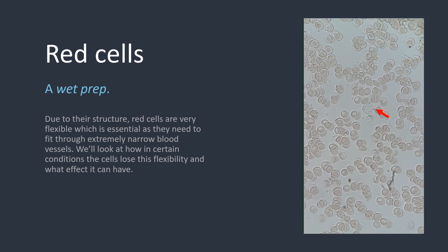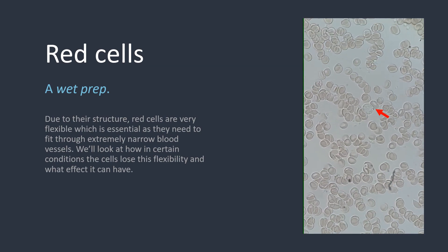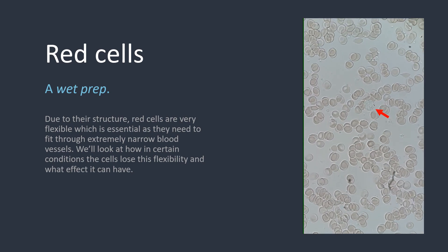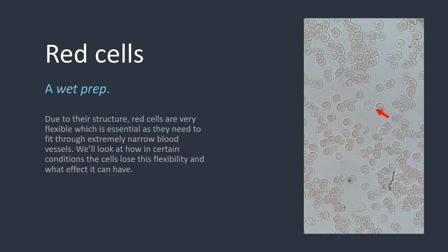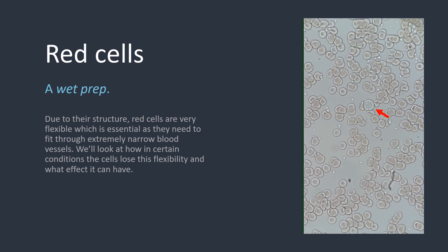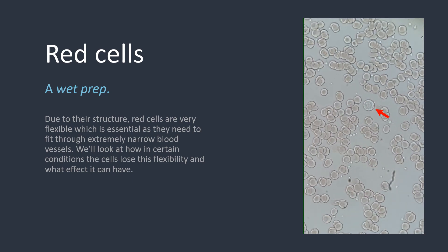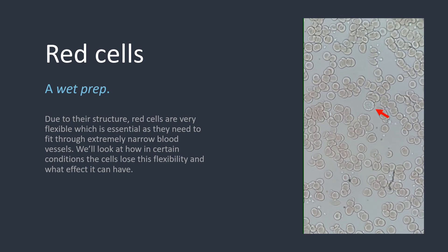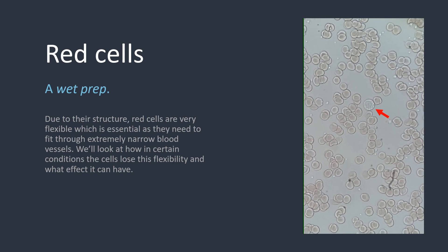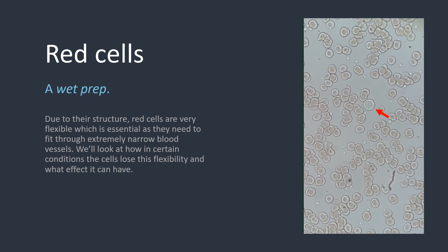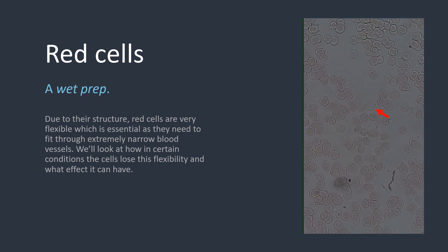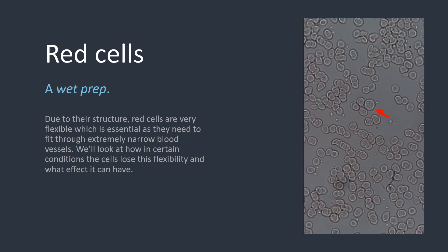Before we start I wanted to show you what red cells look like when they are unfixed and unstained — it'll help you appreciate what they do. The clip on the right hand side is from a wet prep. I added a drop of blood to a glass slide, put a cover slip on top and viewed it under the microscope. Focus on the immobile white cell marked by the red arrow and look at the red cells moving past it. The red cells are extremely flexible, almost like droplets of oil, and they easily glide past the white cell.